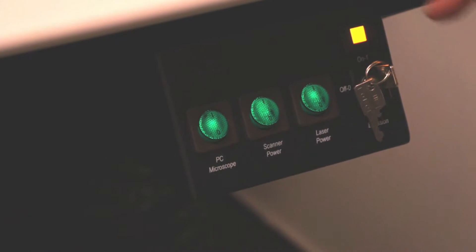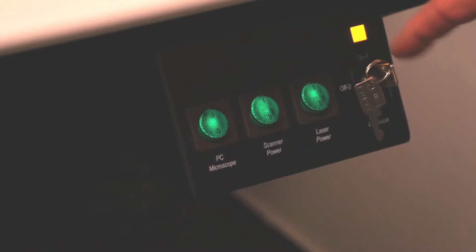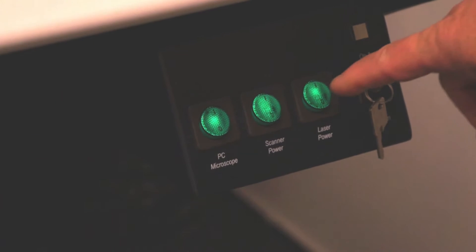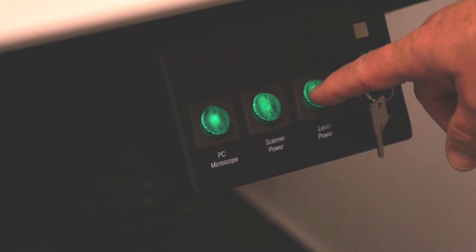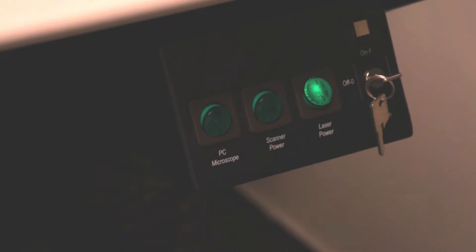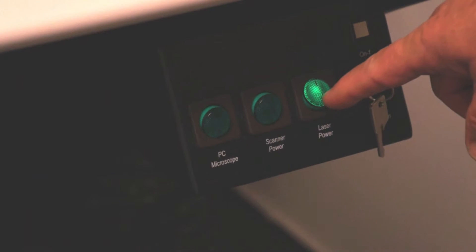The power down sequence for the microscope and the computer is as follows. Turn off the laser key. Skip the laser power button and turn off the scanner and the PC and the microscope. After 15 minutes, you can turn off the fan that's now cooling the lasers.